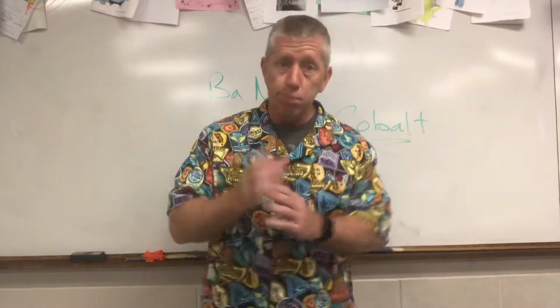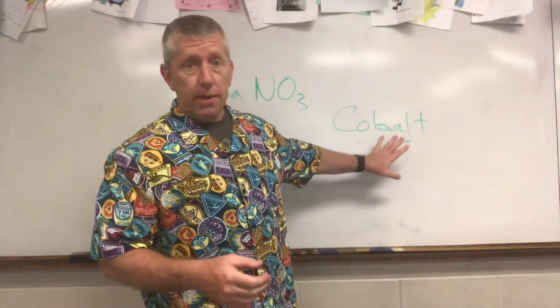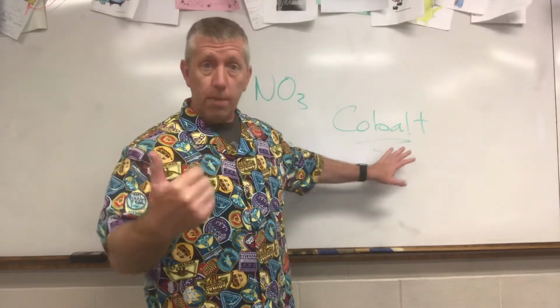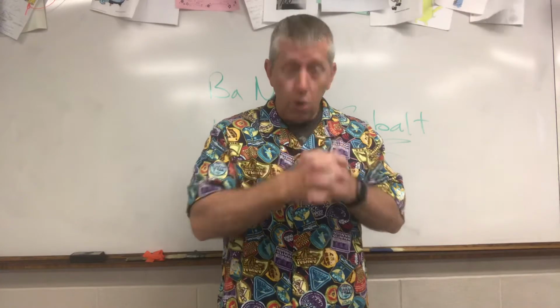You can look this up on YouTube as well: the potassium test with cobalt glass and the sodium test with the cobalt glass. And report what you see through that glass. It's kind of hard to find this one, but you can do it. It's a sodium and potassium mixture with cobalt glass.